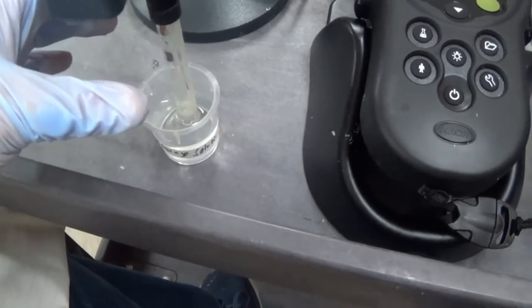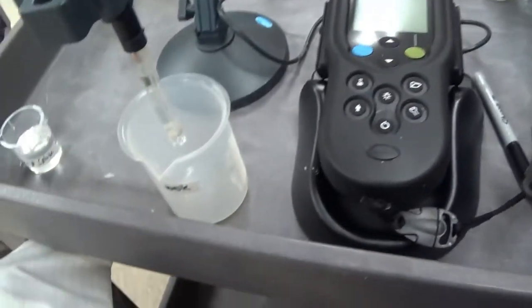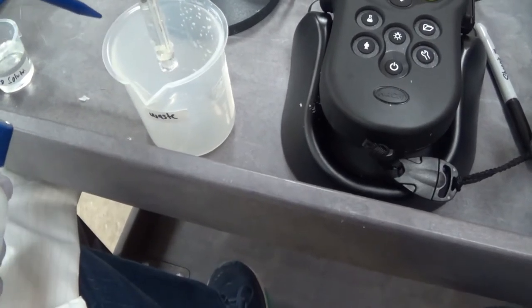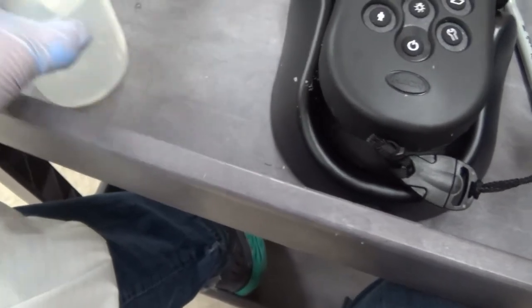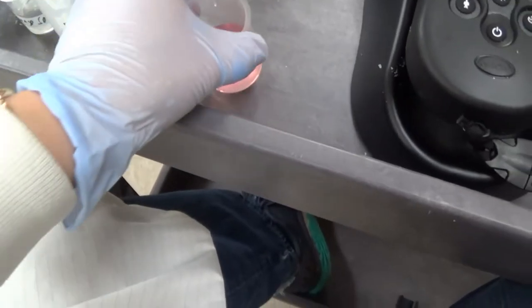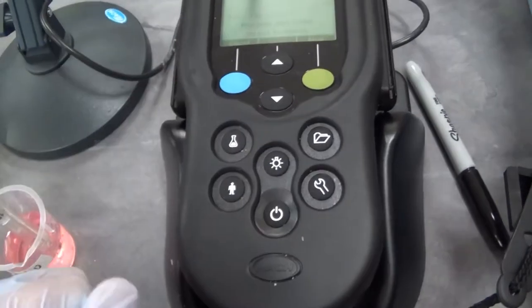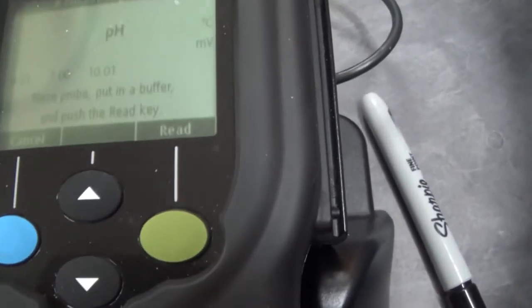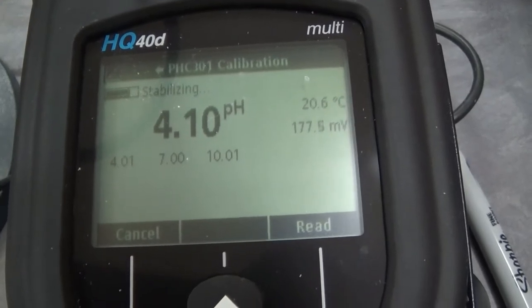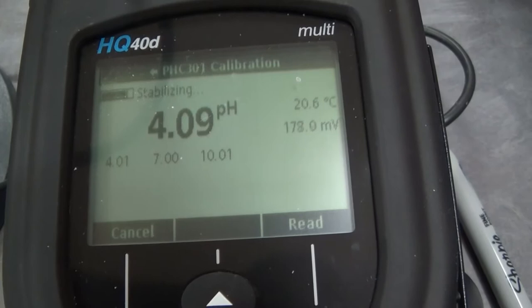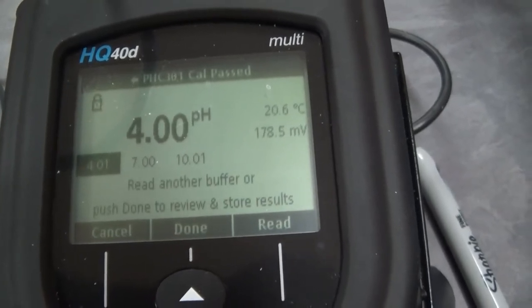I am going to lift my probe out of the storage solution, rinse it off, blot it dry, and put it into my 4 standard. Hit calibrate. Rinse probe, put it in a buffer, and push the read key. Read. See it is stabilizing. It is done.